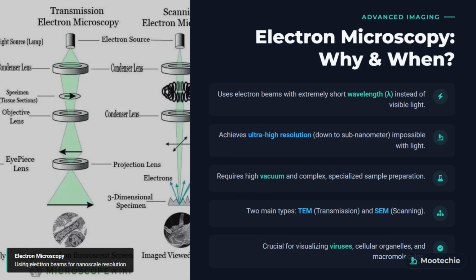Now, let's push beyond the limits of light. This slide asks, electron microscopy, why and when? The answer is in the wavelength. Electron microscopes use beams of electrons, which have a much shorter wavelength than visible light. This allows them to achieve ultra-high resolution, down to the sub-nanometer level. We can see viruses and molecules.